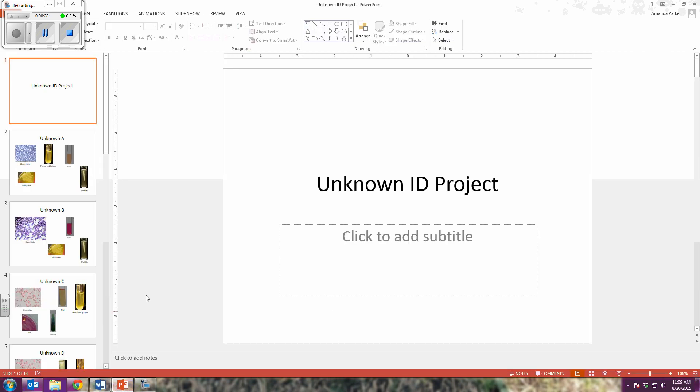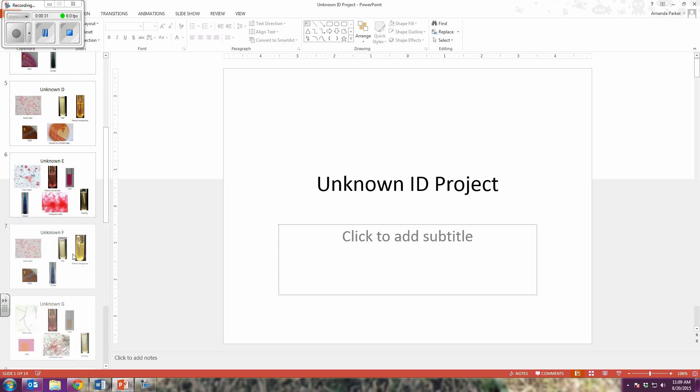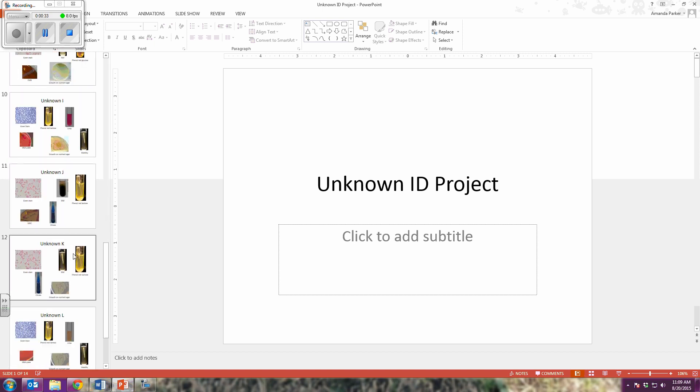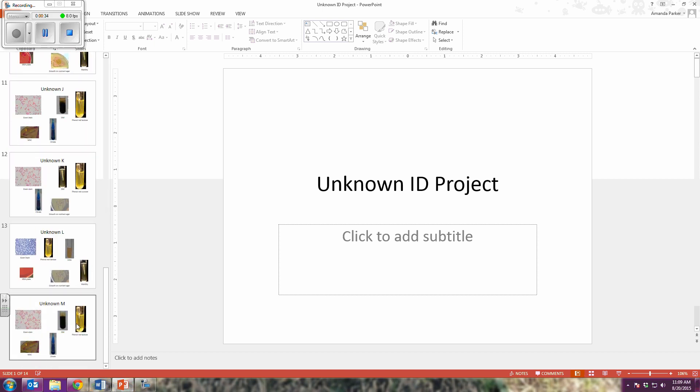I then pull up the unknown ID project PowerPoint and scroll through until I find unknown M.